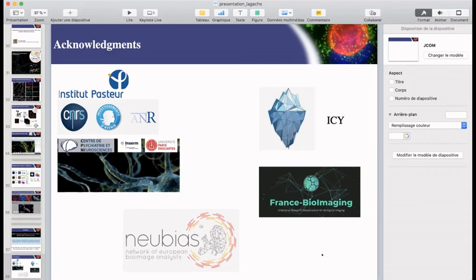Thibault, can you just give the name of the protocol you're talking about? Is it the STORM 3D? Yeah, STORM 3D SODA. And there is a STORM 2D SODA. In the STORM protocol, you have to specify the columns. And I talk rapidly, but you also specify how you are going to build your clusters. And in Icy, what we have is the DBSCAN.